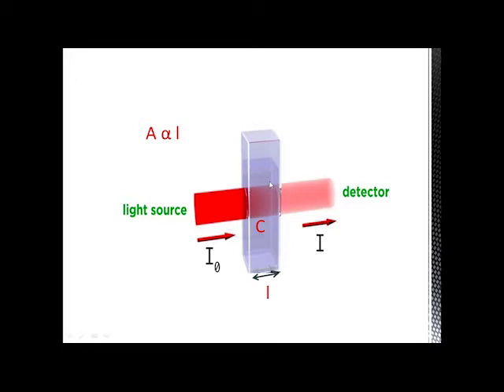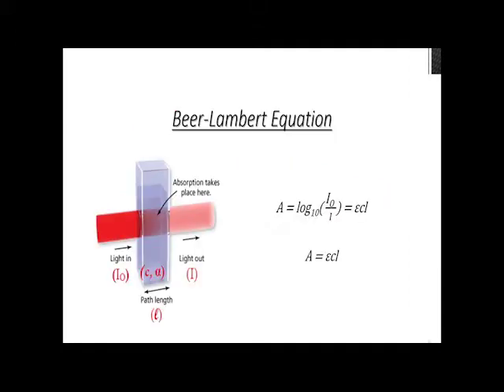So this decrease in transmittance, because of absorbance in the solution, is dependent upon the path length of the solution.